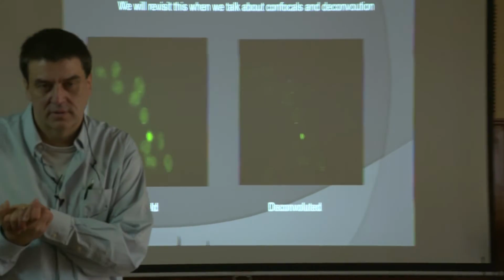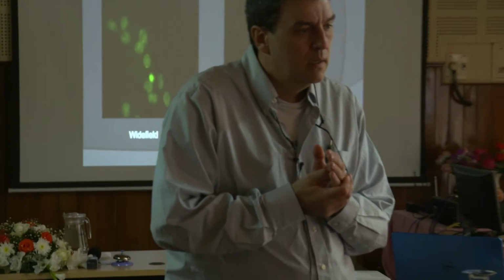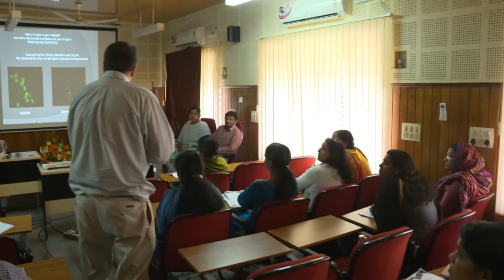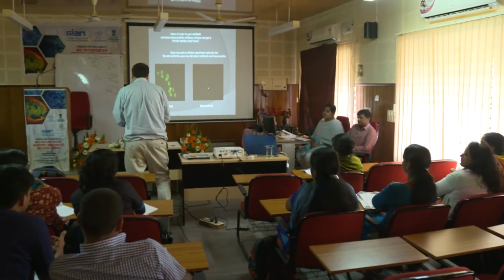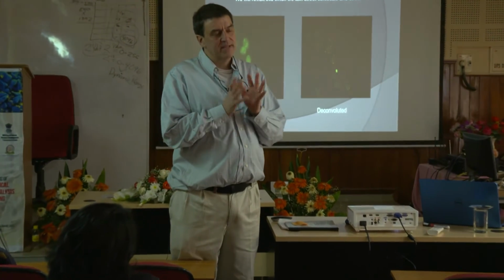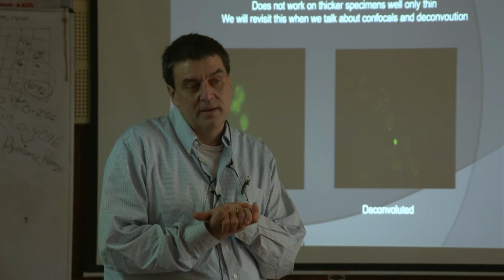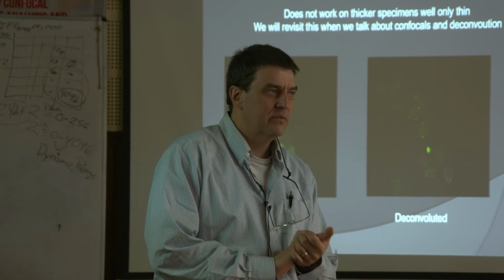Any other questions? Yes. Can we avoid background noise in fluorescent microscopy? How can you avoid background noise with the microscope? Okay, so the best way to avoid the background noise usually is in the preparation. Once the microscope takes the picture, you've already got the background.